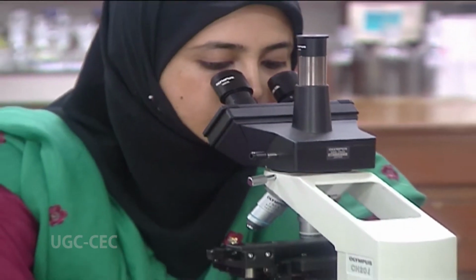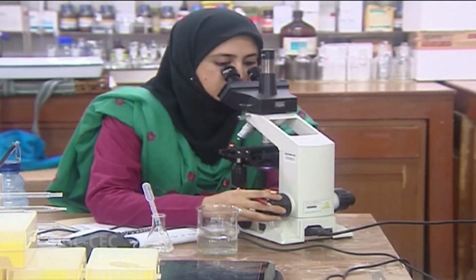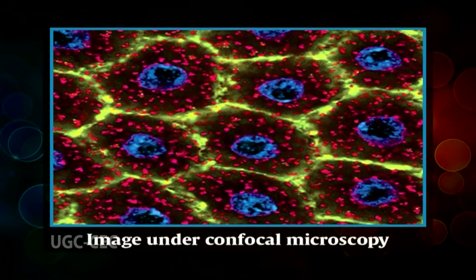One of the main problems is out-of-focus blur degrading the image by obscuring important structures of interest, particularly in thick specimens. In conventional microscopy, not only is the plane of focus illuminated, but much of the specimen above and below that point is also illuminated, resulting in out-of-focus blur from these areas. This out-of-focus light leads to a reduction in image contrast and a decrease in resolution. In the confocal microscope, all out-of-focus structures are suppressed at the image formation.